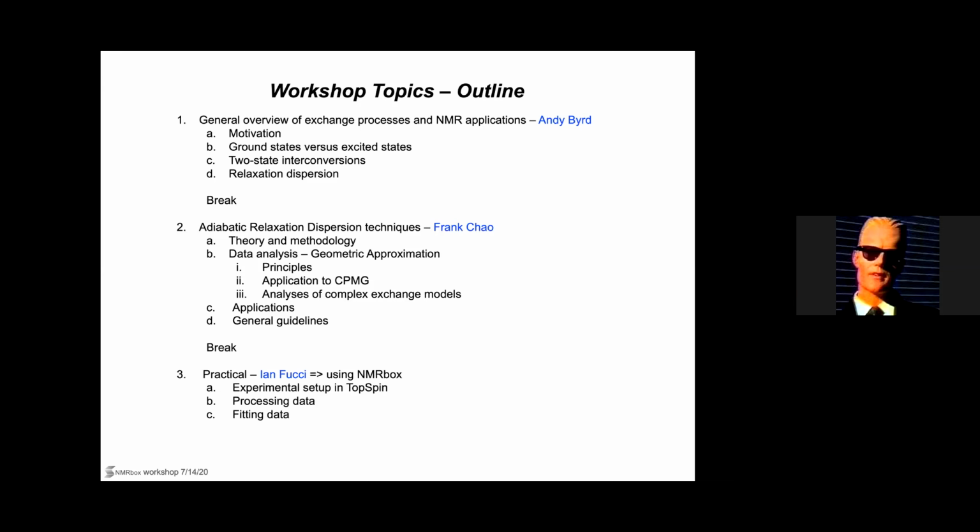Andy, Jeff here. So you focused on the extended sensitivity to time scale. What about the sensitivity to populations? Are the constraints more or less the same that you would experience with CPMG experiments? That is the limit of detection of the population of the minor state.